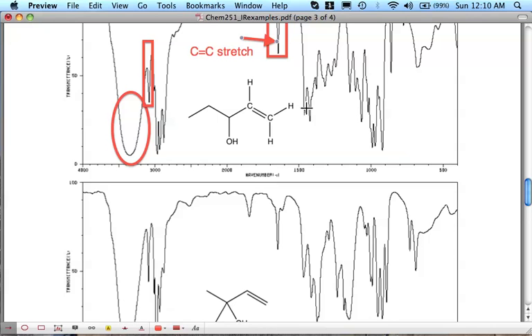So what we're looking at is where peaks come and their relative intensities to each other. And you should then be able to do it. Of course, you'd have to have already narrowed it down to something with, let's say, this molecular formula and be looking through various possibilities and comparing their IRs, so it could still be a little bit laborious. But of course, that's what we're going to be learning shortly, other spectroscopic techniques like NMR, for example, which would help us narrow down maybe even quicker a few possibilities that we could then look up the IR spectra of.